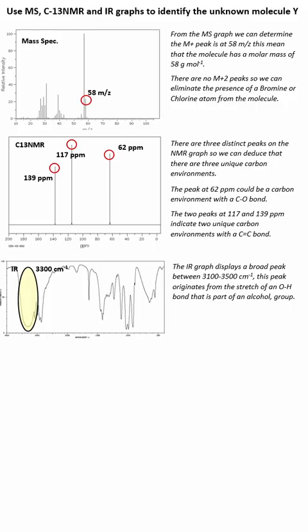We can see that this peak, the shape of this peak, that particular blunt shape, originates from an O-H stretch when the OH is attached to a carbon but not a carboxylic acid. If it was attached to a carboxylic acid, then the actual peak is considerably more broad. So we know this has come from an alcohol group, so there must be a carbon bonded to an oxygen that is part of an alcohol group.